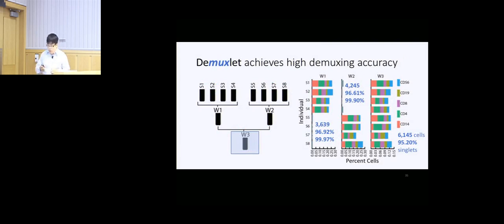So if we multiplex 4 samples together, then we get this accuracy. We think we can improve the accuracy even more, but the current numbers suggest that to obtain more than 99% single assignment accuracy from 64 samples, we need about 50 reads that overlap with SNPs, so reads from at least 50 different SNPs.